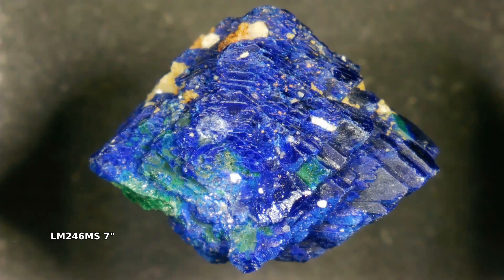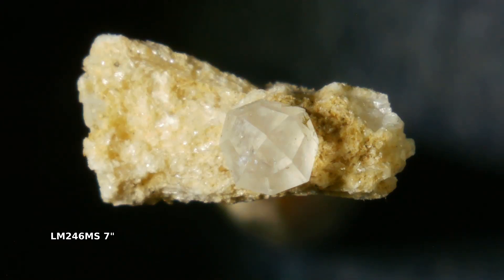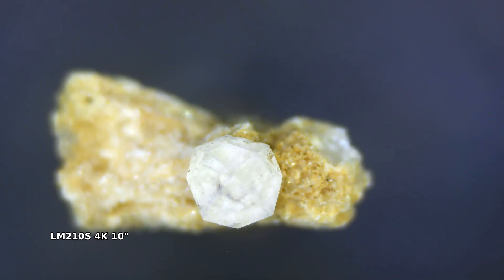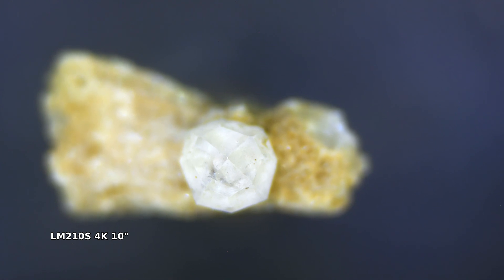The main thing you're going to be looking at here is the difference between the 7-inch and the 10-inch. We're looking at a piece of Azurite, and you can see we've got some cloudiness and haziness. These are short video clips. This is on the 10-inch 4K — a lot crisper. I really gave this a hard go of it. Back to the 7-inch, a piece of Analcime that is incredibly small, but we can see the structure of it. Over to the 4K, you're going to see this kind of focusing in and out — that's normal. We have a very narrow depth of field, but we can totally see the structure.